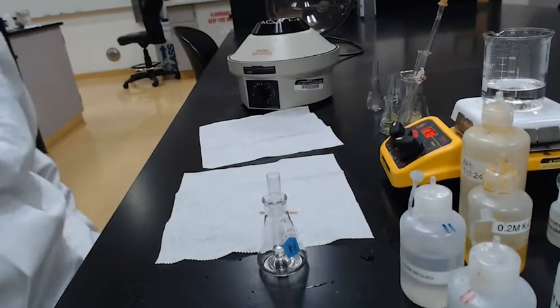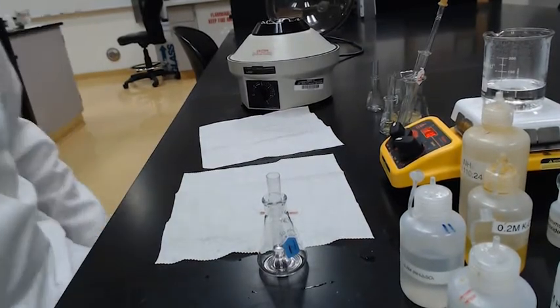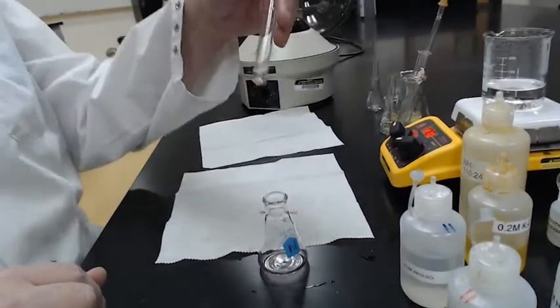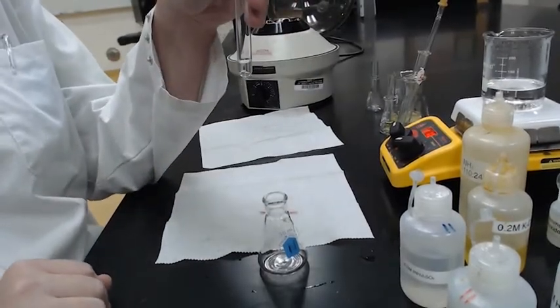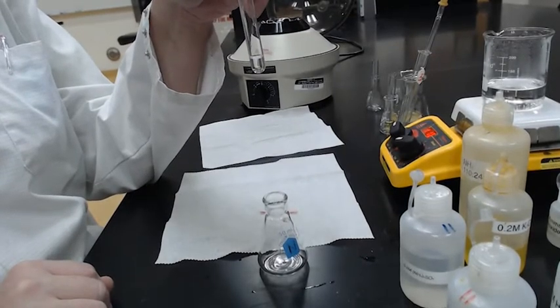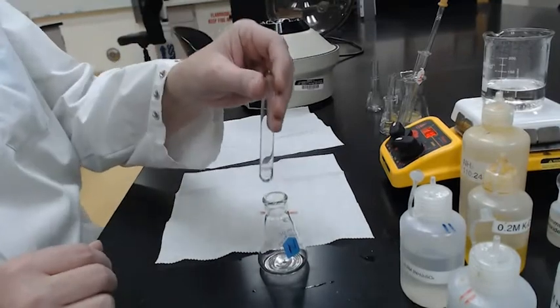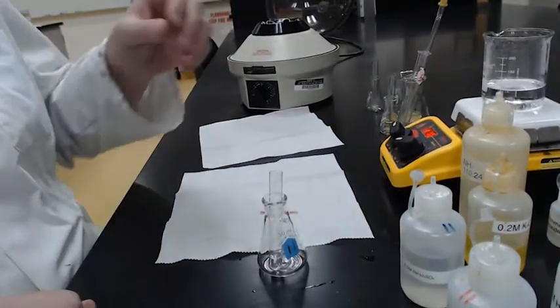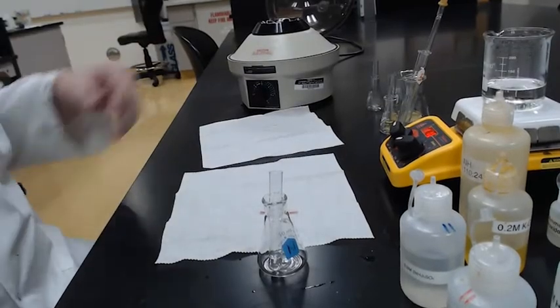Now for the magnesium test. What we're going to do is we take the decantant, and it says to divide it into 2 equal portions. One is to go do the magnesium and potassium test, and we're going to need a small evaporating dish. So let's stop rolling for a second, and we're going to do both at the same time.